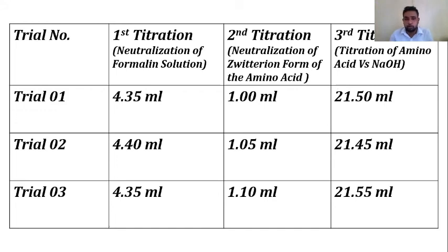We are not robots, we are human. Depending on the person who was conducting the titration and the way he handled the burette, and depending on the environmental conditions and the accuracy of instruments, these readings can vary. That's totally okay. When we are doing a titration or a chemical analysis, this kind of variation can happen and it is allowed.